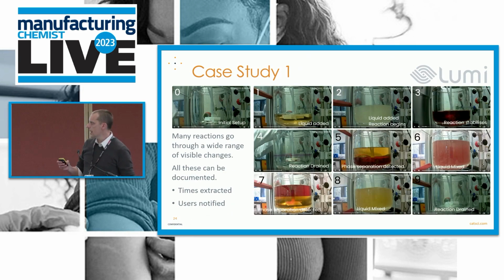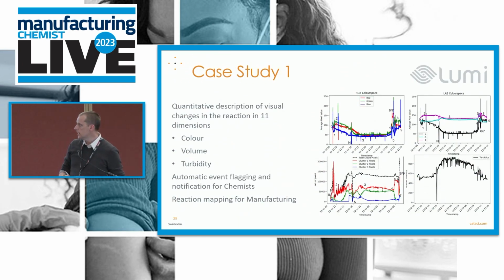Okay, so reactions go through all sorts of changes. This is a diverse example. So you have different colored liquids, there are different phase splits, there are different precipitations, there are different emulsions. All of this data can be captured and then logged through the whole duration of this experiment. This is about a 20-hour experiment, something like that. And you can start to extract the data, and here there's 11 different dimensions which describe the progress of that reaction. So there are 6 different color domains, and then there are 4 different volume parameters, and in this example, a turbidity monitor.